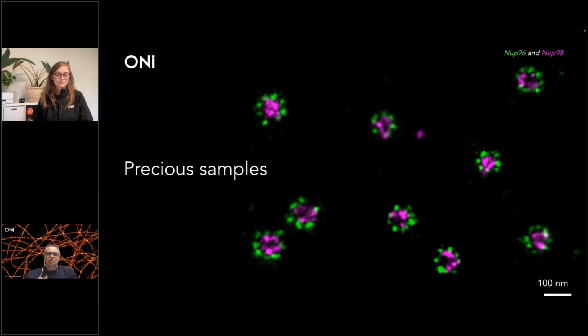However, you can use gel matrices, extracellular matrix, the different combinations nowadays which can mimic the extracellular matrix, and you can include in your solution some cytokines which can affect the behavior of your cells, in this case if you are talking about immune cells.